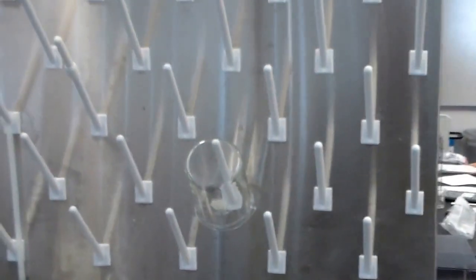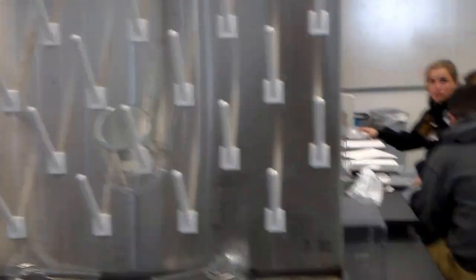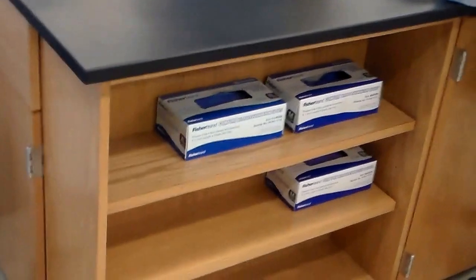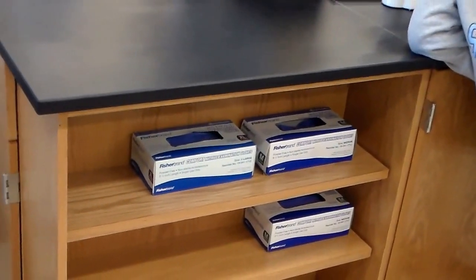When we're drying things we put these onto the drying rack so they don't fall down and break. Lab gloves are going to be right there in the center of the room and on the opposite side of the same bench. Whenever you need gloves, use them.